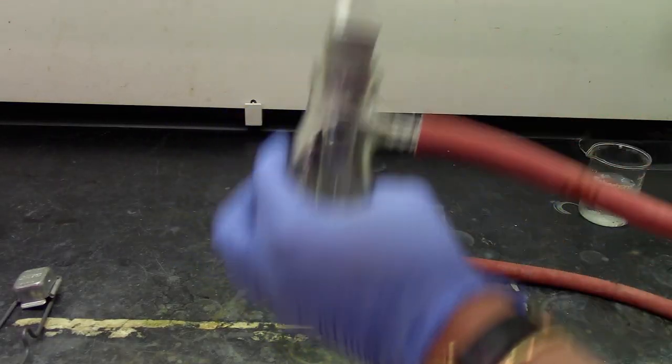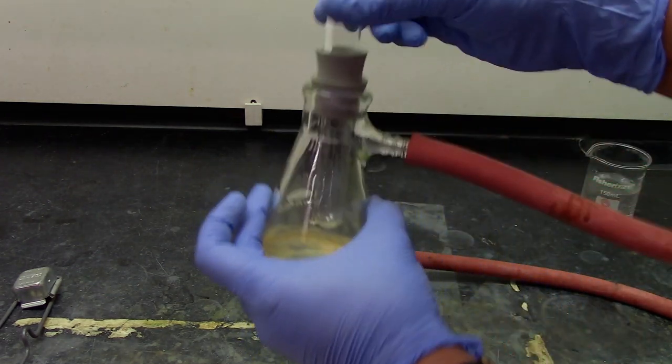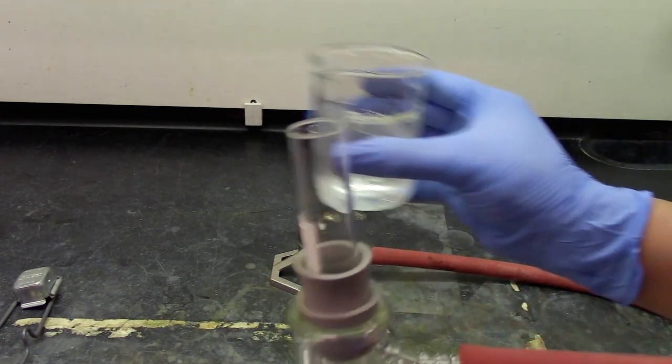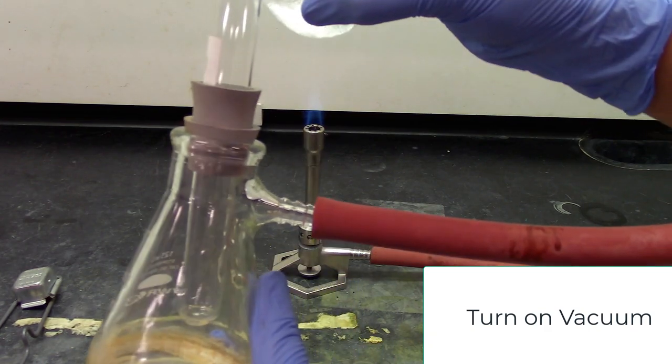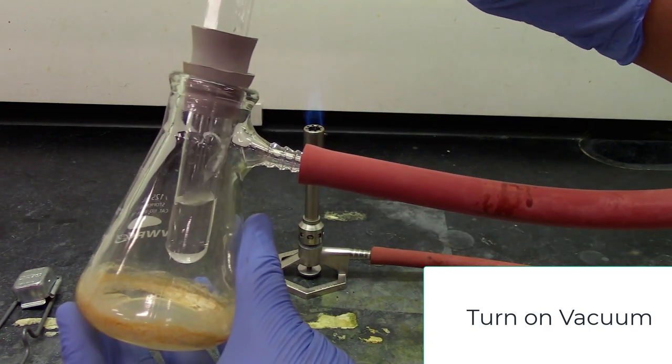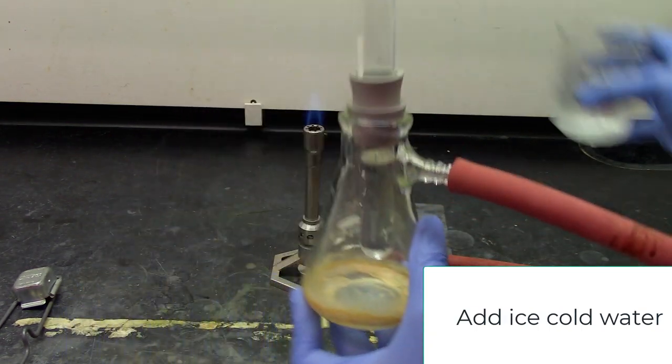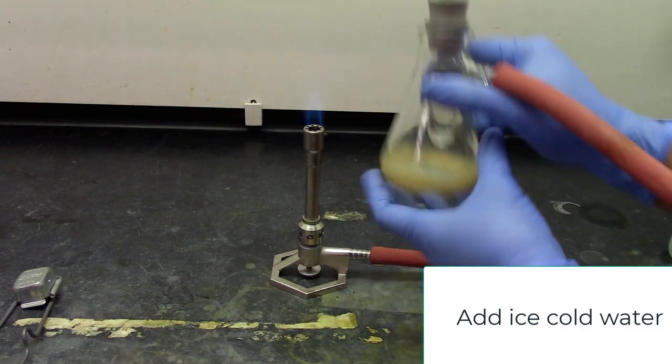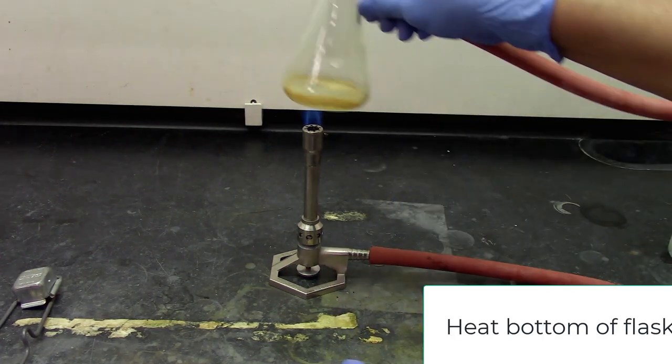For a successful sublimation, this should be the order: first you've got to turn on the vacuum, add ice-cold water in the test tube, and then start heating the bottom of the Erlenmeyer flask on the Bunsen burner.